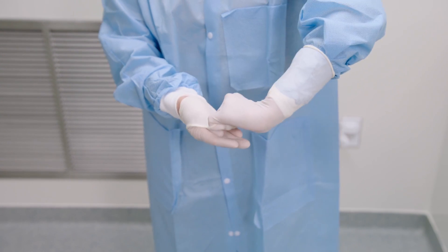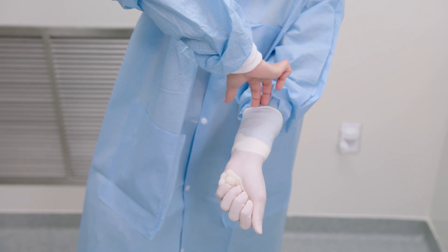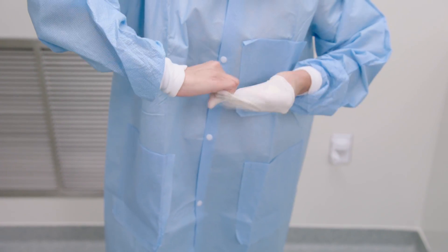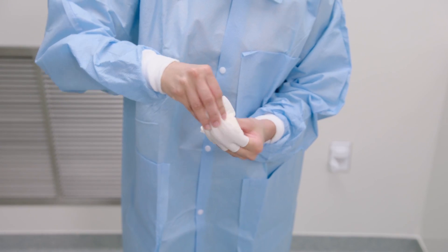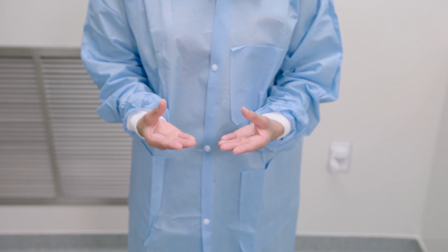To remove the bottom glove, place your bare fingers inside the cuff without touching the glove exterior. Peel the glove off from the inside, turning it inside out as it slides off. Use it to cover the other glove and discard.